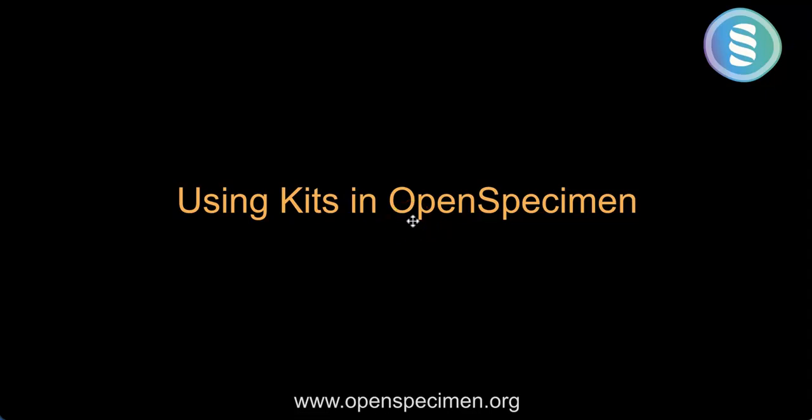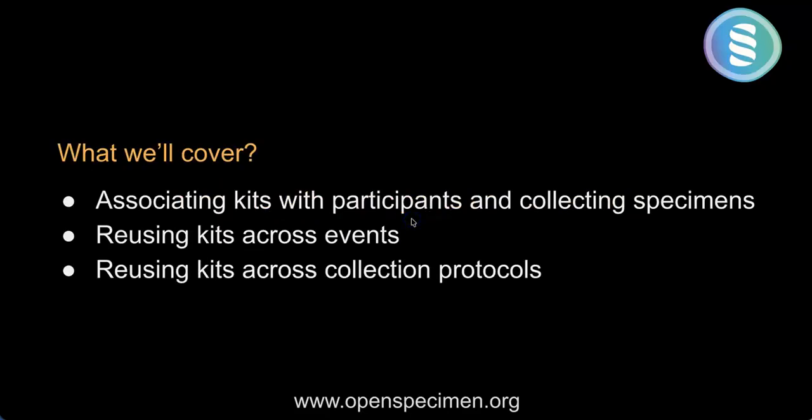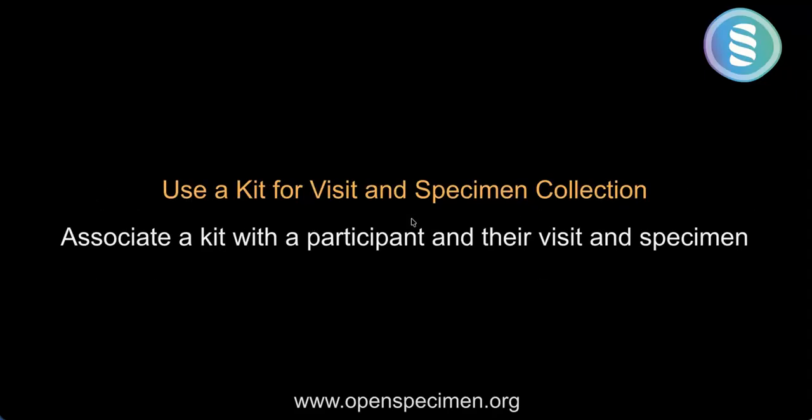Hello everyone, this is Ankita, and in the previous video we looked at how to configure the kits in OpenSpecimen. In this video we'll look at how to use kits in OpenSpecimen, wherein we'll cover how to associate a kit with a participant and collect their visit and specimen. And we'll also look at how to reuse the kit across the events and collection protocols.